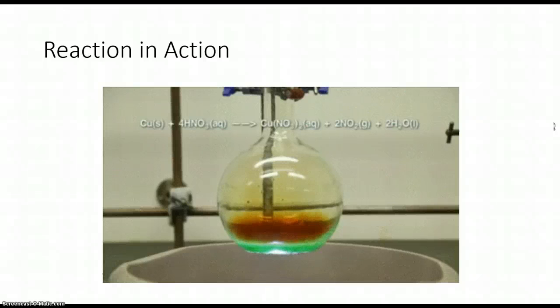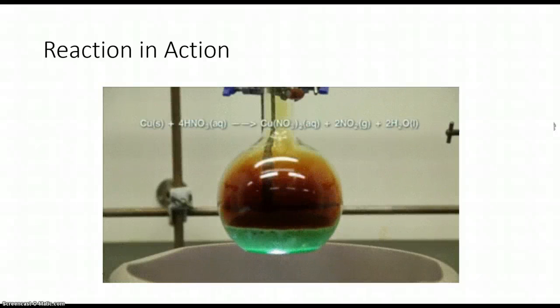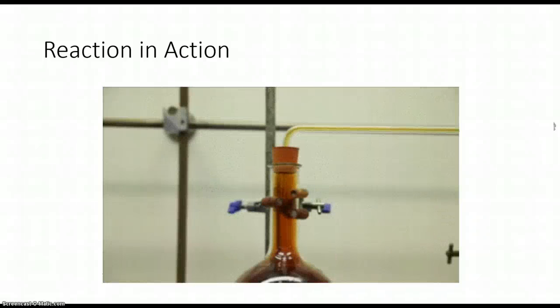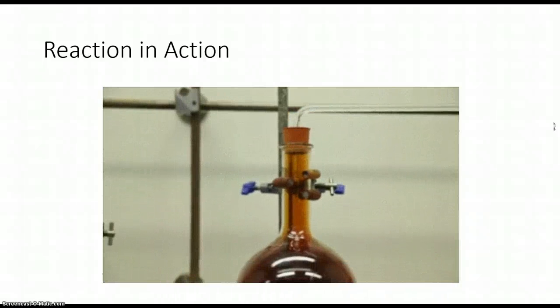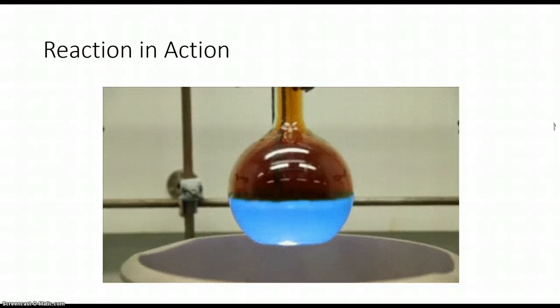So when the reaction begins, a bunch of gas is produced. That's the nitrogen dioxide, I believe. And it comes up and out, and what's left is this really bright blue color. I thought it was really cool. Yep, there it is.